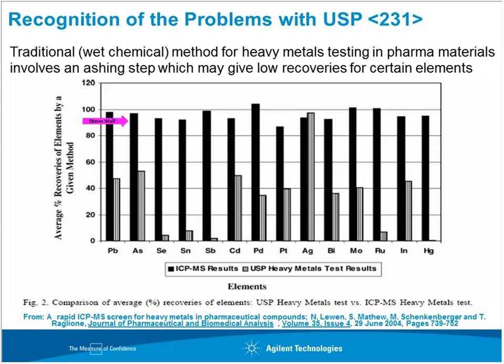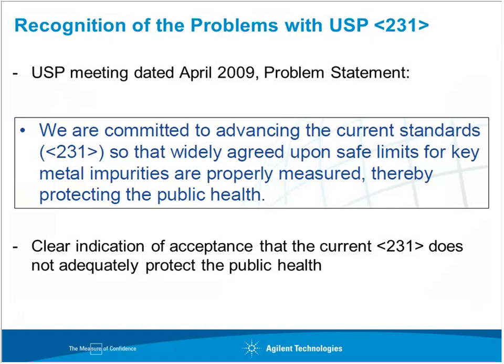So the study was published in 2004, and a short time later, USP appointed an advisory panel with both experts in methodology and toxicology.